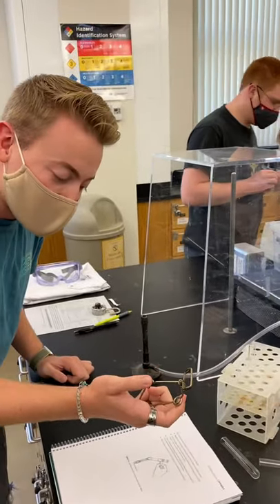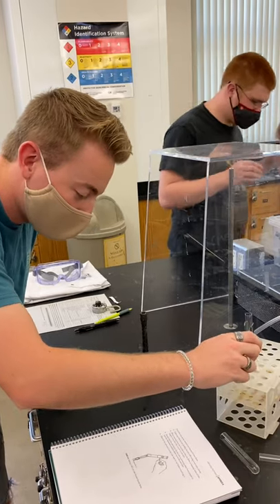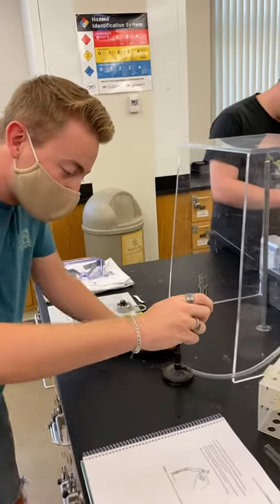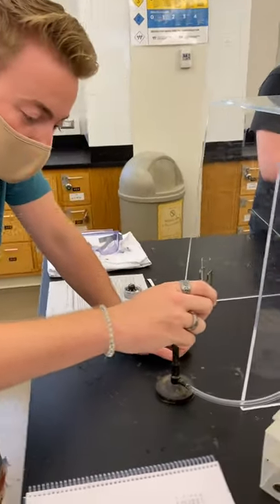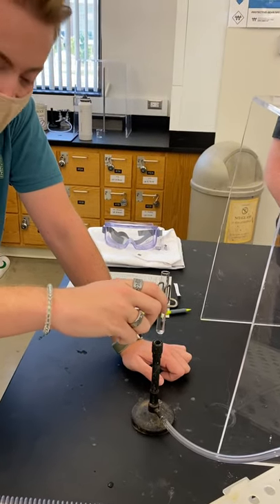I'm going to make sure that I'm holding the test tube using this test tube holder. While heating, move the test tube so that the flame is heating most of the length of the test tube, not just in one spot. So you just move it around a little bit like that.